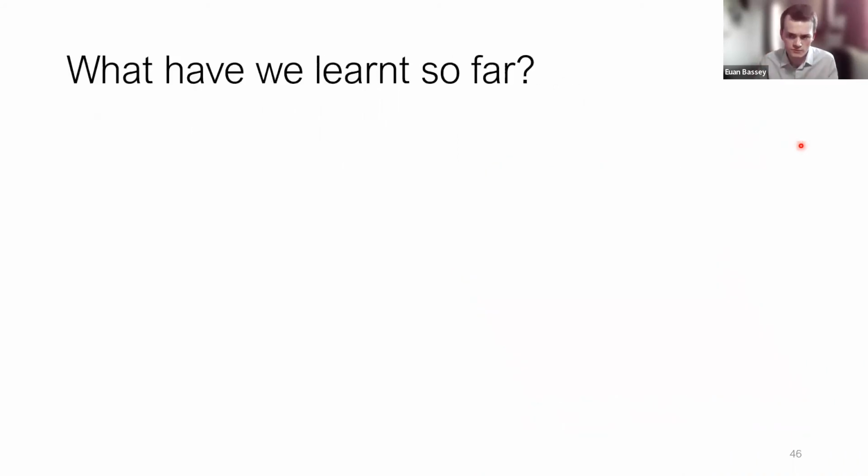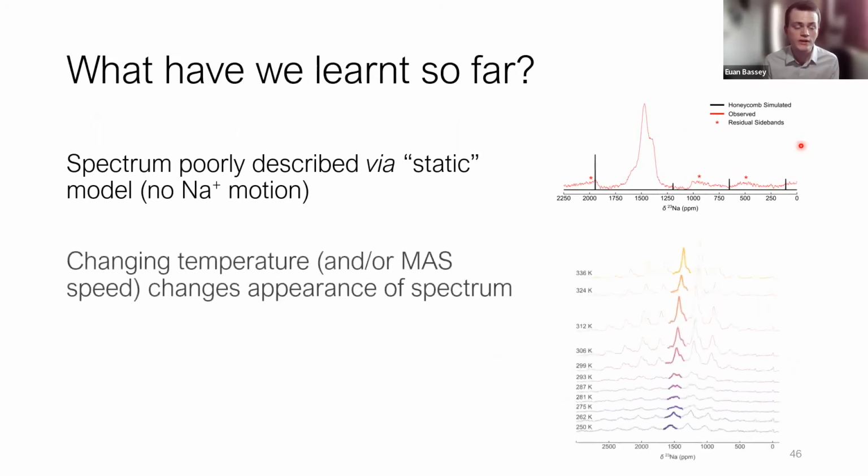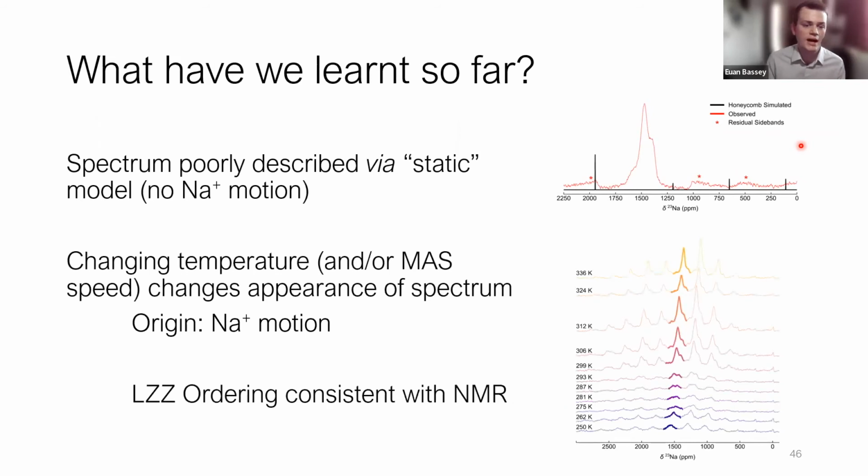Okay, so what have we learned from the sodium NMR? We know that the spectrum is poorly described by just a static model, so we need to account for sodium motion, and that long zigzag ordering is consistent with NMR simulations that we have.